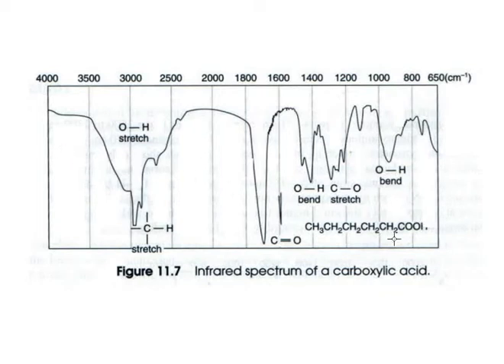Now, let's take a look at the peaks. One thing we mentioned is that the carboxyl OH group, the stretching motion that it has, produces a very, very broad camel's hump type of peak. And here it is right here, starting out about 3,500 and moving all the way down to around 2,500. This right here is one peak. Now it's superimposed by the peak here, which is due to the CH alkyl stretches. There are lots of CH alkyl bonds in this molecule. In the carboxyl group, of course, there's a carbonyl group producing the carbonyl stretching motion. That carbonyl stretching motion produces the prominent, fairly large peak here, and it's going to be around 1720 or so.